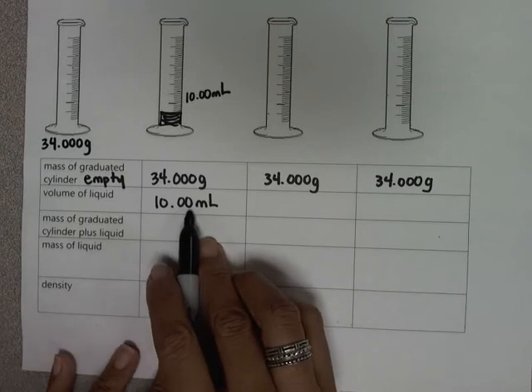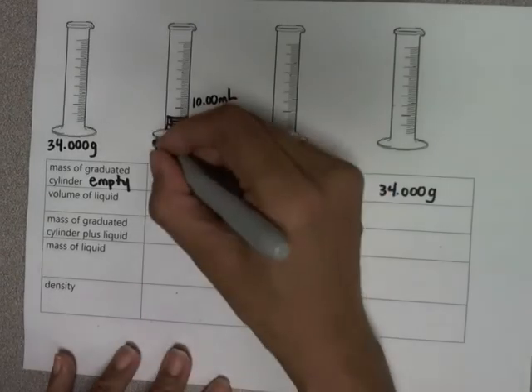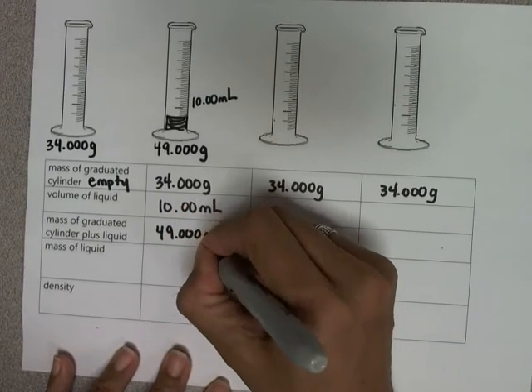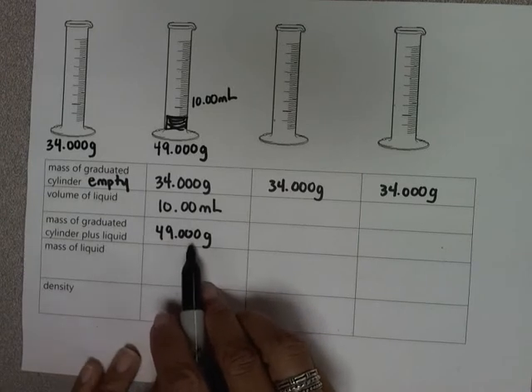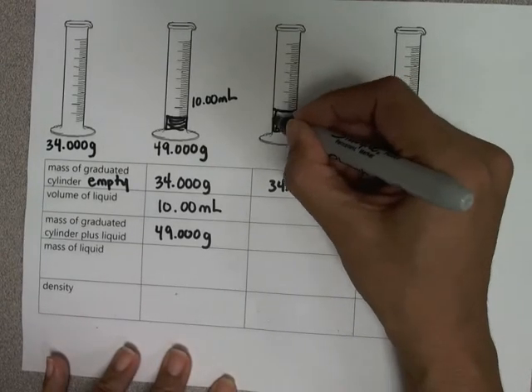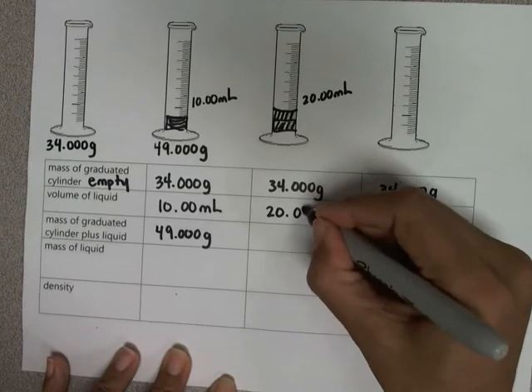So now I need the mass of the graduated cylinder plus the 10 milliliters of liquid. All right, so let's say when I get that mass, that's 49 grams. So the mass of 10 milliliters of liquid plus the graduated cylinder is 49 grams. Next I add another 10 milliliters of liquid, and so I have a total of 20 milliliters of liquid in the graduated cylinder.